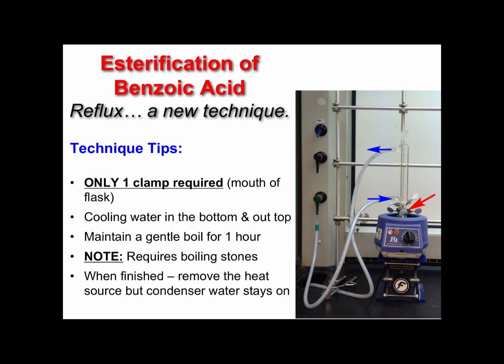As we're coming up on lab practicals, I would emphasize this repeatedly. Quite often when things happen in lab practical, it's due to people not focusing on making sure their clamp is secure. So if you have questions about clamping, please talk to us. But clamping is a really critical issue.